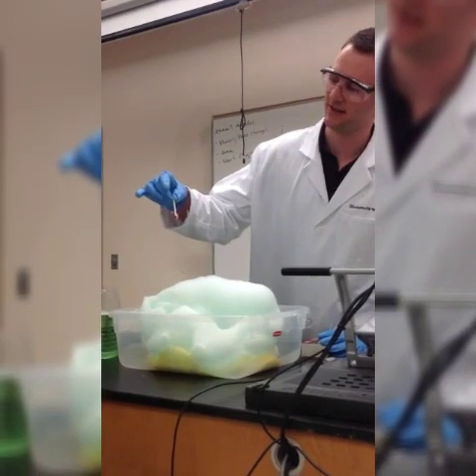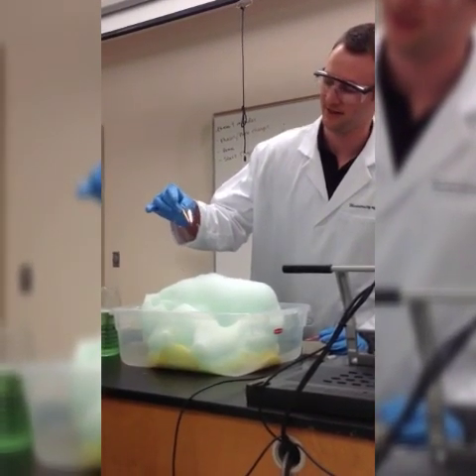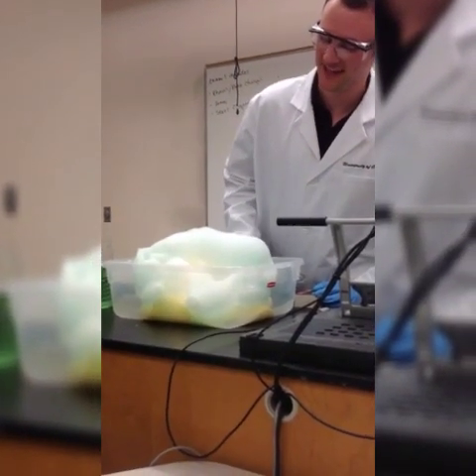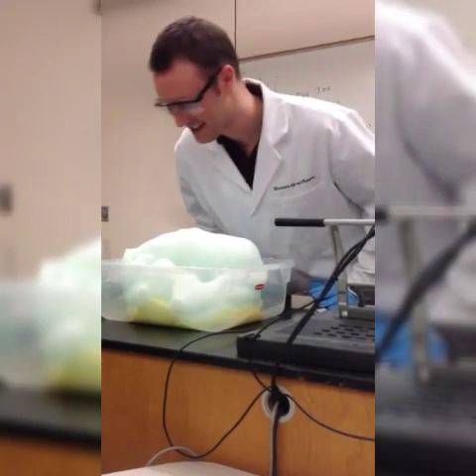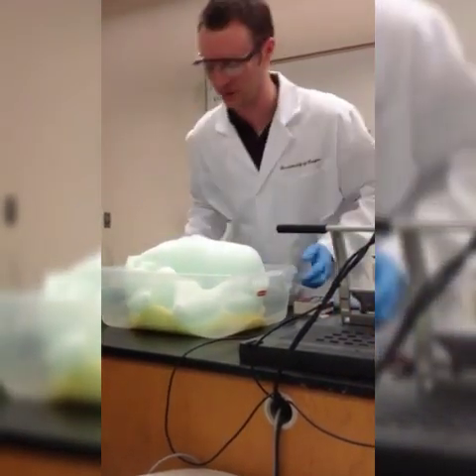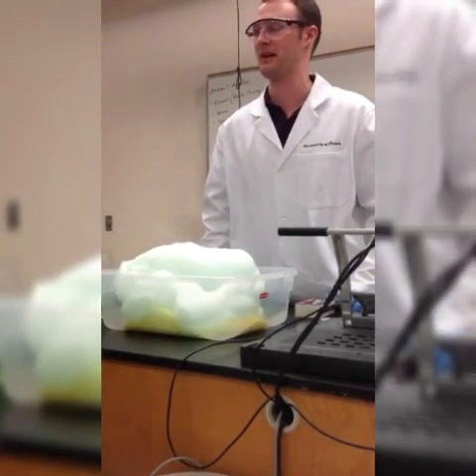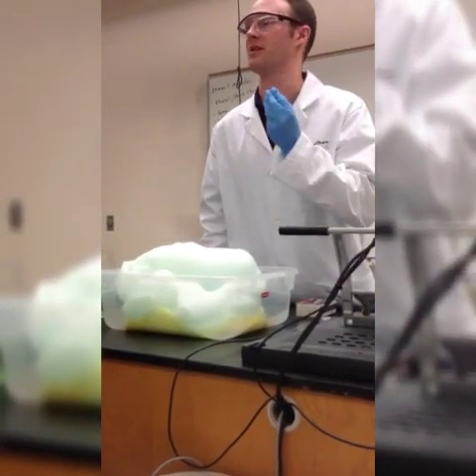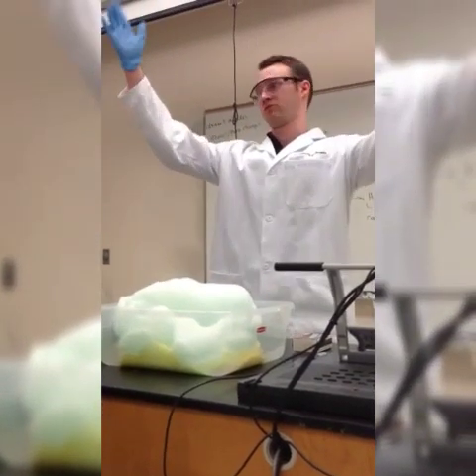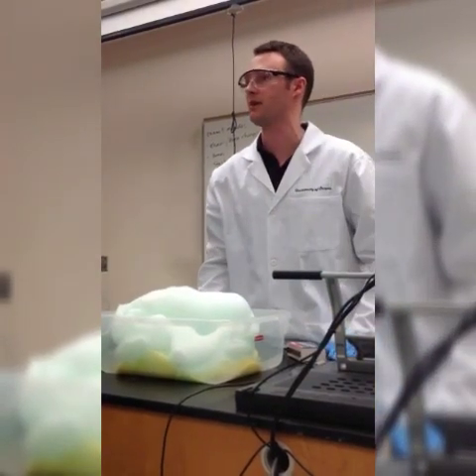These are all the matches. And if you drop this in, sometimes it's cool. So let's see. It just kind of burned a nice hole through here and completely burned the match. It's just a big hole. So yeah, oxygen just helps things burn. It does not burn. This whole thing didn't go up. It just helped my match, which can burn, burn faster.